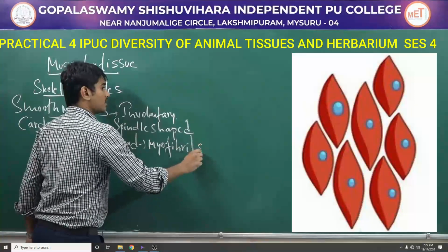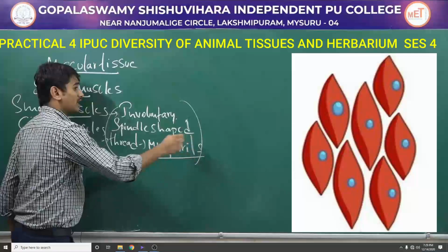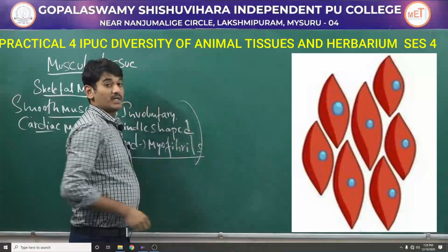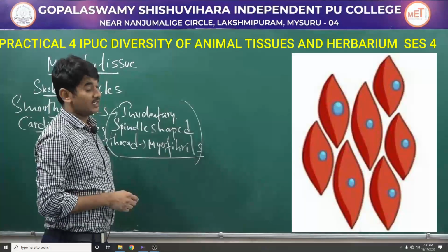Myofibrils means muscle fibrils. There is sarcolemma with thin sarcoplasm and a centrally placed nucleus.